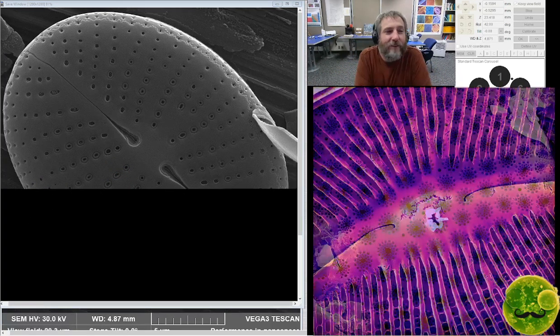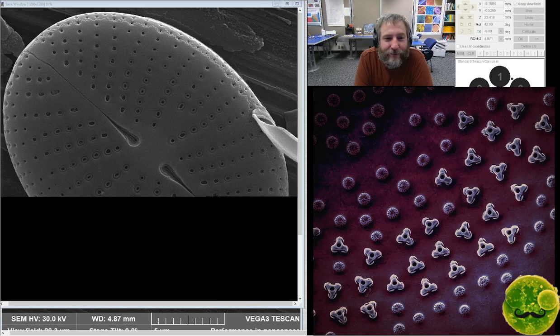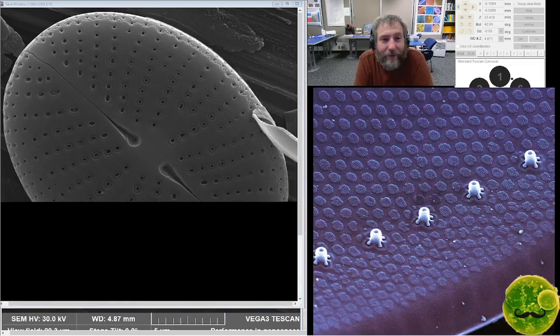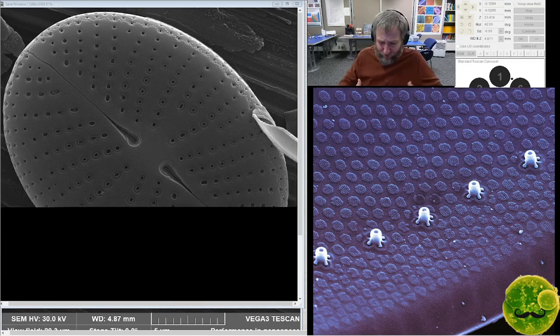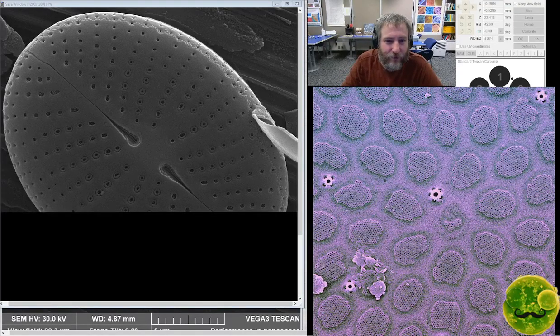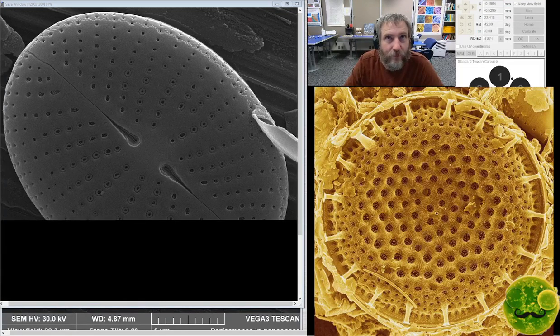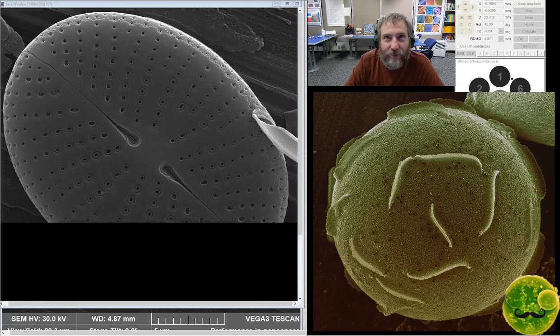I had tardigrades on. I did a light microscope stream from home, I don't know, Saturday, I think, or Sunday. I did a little live light microscope stream just to dust off the microscope a bit and look for water bears. And we saw some really cool ones. These red armored ones that are sort of medium sized, and then I got a really really big one, and then we had these little ones that I usually see, but the really big one was kind of interesting. And some cool rotifers, saw some ciliates, a bunch of nematodes, the regular. I collected some sticks from my driveway and from the roof of my house.